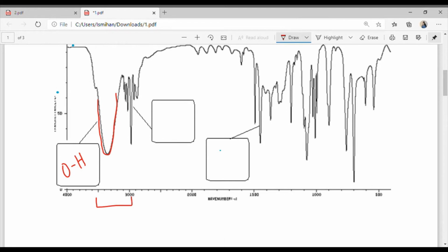Note that infrared spectrums only really give you functional groups. They won't give you exact bonds. So they aren't completely reliable, which is why you need to rely on something like a 1H or 13C spectrum to give you those specific bonds.